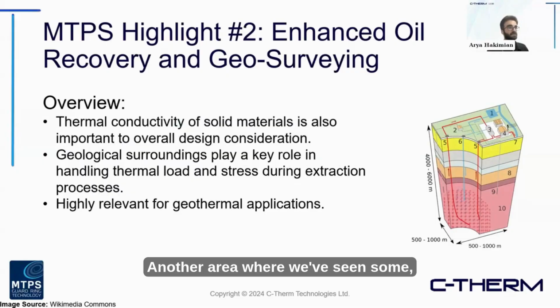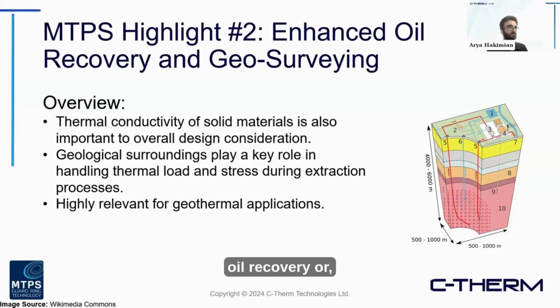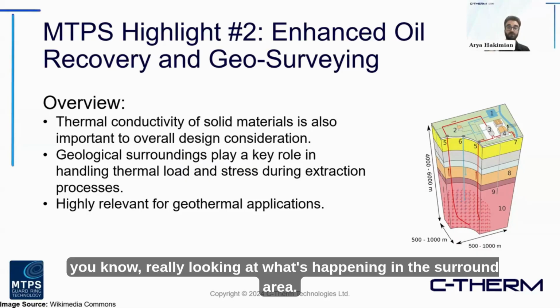Another area where we've seen some application of the MTPS, and again, the pressure testing options, is when you're looking at enhanced oil recovery or geosurveying of some of the surrounding materials. So maybe it's not necessarily a sample you're looking to extract, but really looking at what's happening in the surrounding area.